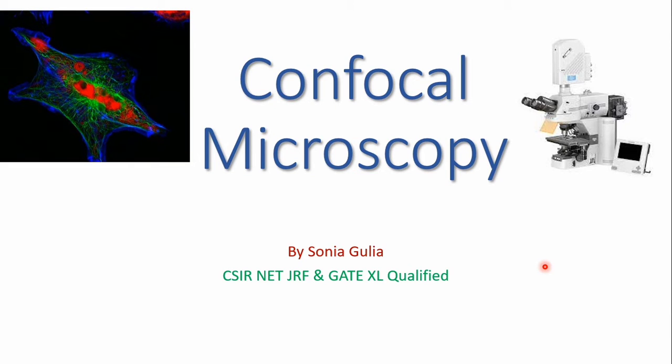So in today's video, I am going to discuss confocal microscopy. Before proceeding with this video lecture, I want to tell you that I have already made a video on fluorescence microscopy. If you don't know what fluorescence microscopy is, go and first watch that, as confocal microscopy is a modification of fluorescence microscopy. So it will be easier to understand confocal microscopy if you learn about the fluorescence microscope. So let's start.